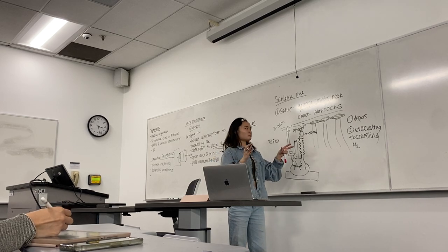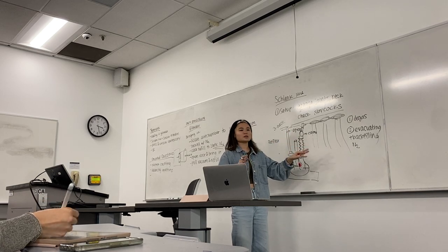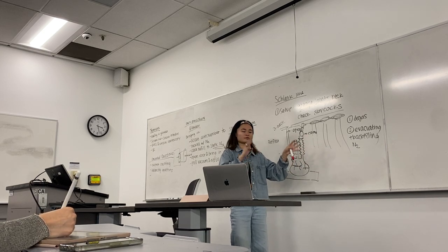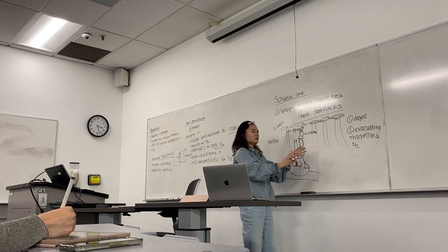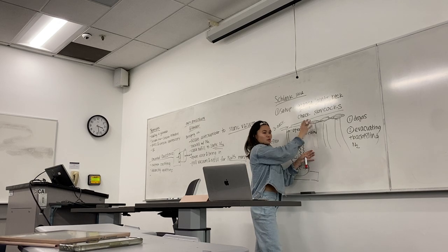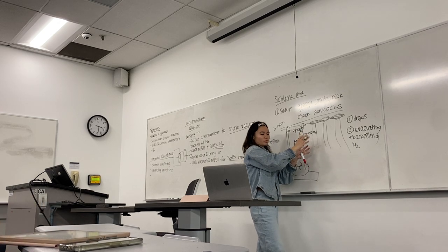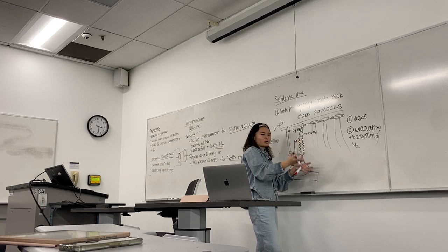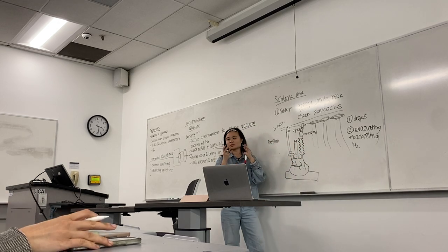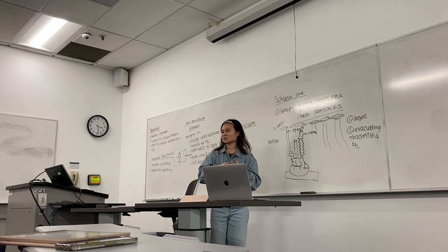So when you set up something on the Schlenk line, be intentional about it. Has this been exposed to air yet? What parts will I need to evacuate, and which parts will I need to refill with nitrogen? As Jennifer was talking about, before you ever open something air sensitive, you want to make sure to evacuate and refill just the line itself. Then you pressurize the flask, then you open the flask, and you work backwards in the other direction, because you always want to make sure your reaction vessel is protected. She already mentioned it, but that's something important to keep in mind.